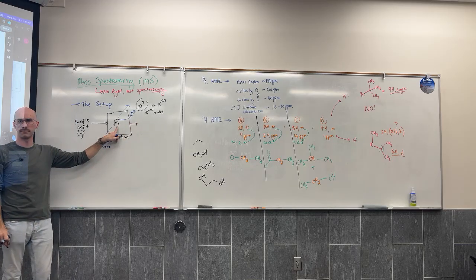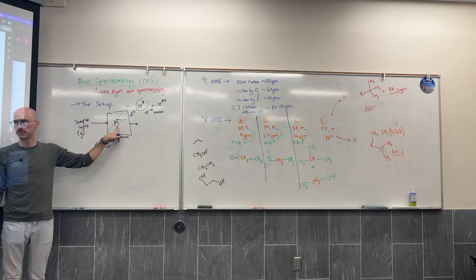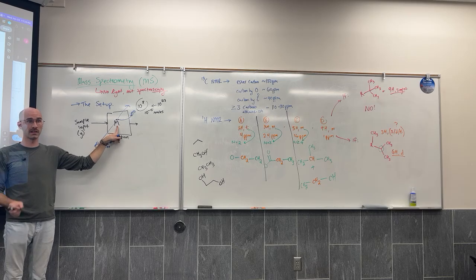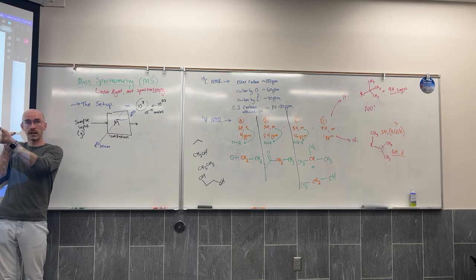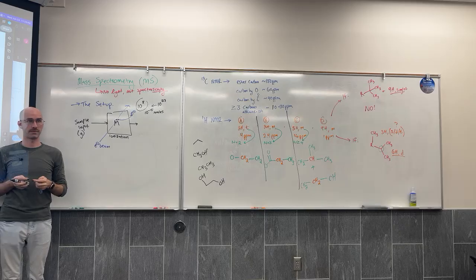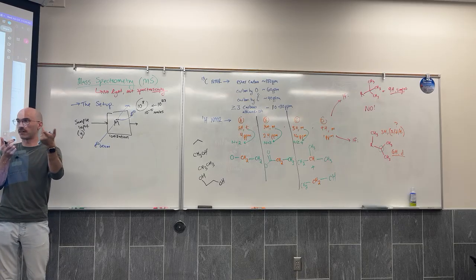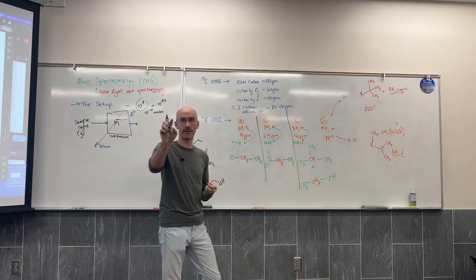Okay, M, molecule. Is that affecting the whole sample or just? Molecule by molecule. But you're right, all of those molecules that are being put in there are each having an electron picked off of them. And again, I think of this like a BB gun on a log, or shooting cans off a log. You're just firing them off.